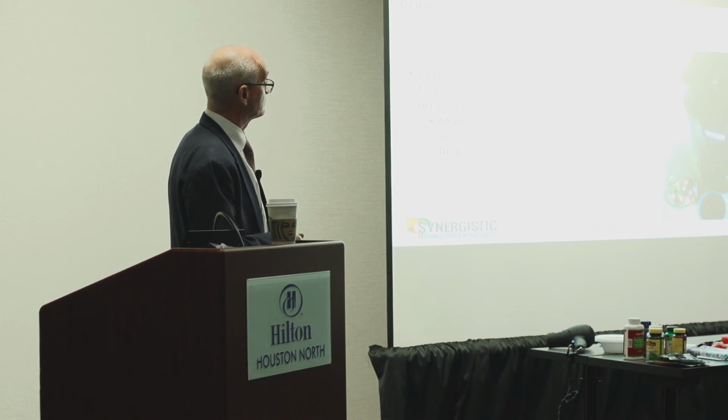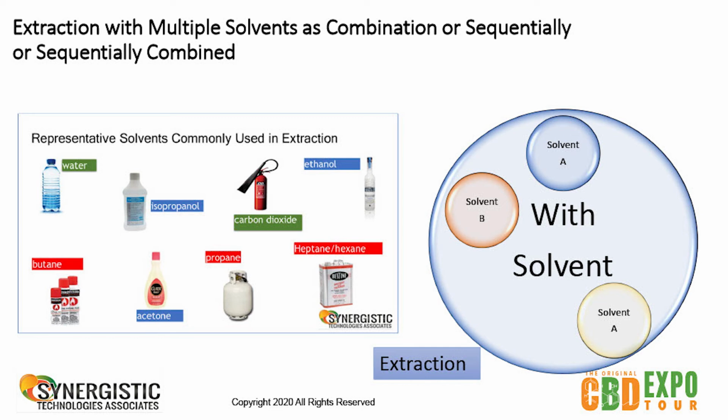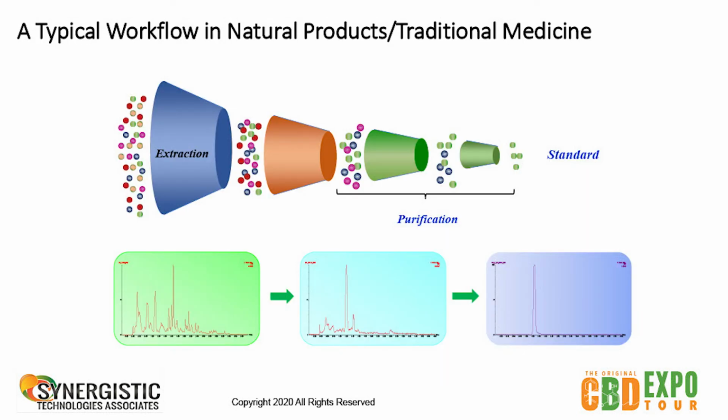So when I talk about solvents, I talk about all the different solvents that can be used in extraction, but they're also all the same solvents that can be used on a very small scale. That's how you learn about each one and what's the best technology for you. Each part of the extraction really is the red and blue balls that allow you to have a lot of peaks. Remember, we looked at the TLC, and this is the absorbance and this is time. You can see there's a lot of peaks. Doesn't matter what they are, there's a lot of them. There's a lot of the balls.